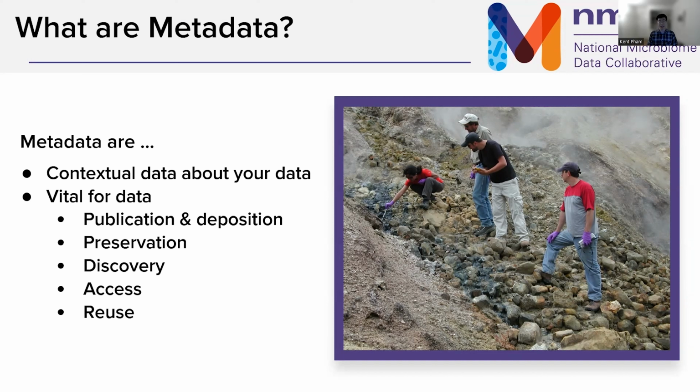It's everything else that you are writing down or making note of, starting with the local environment when you go out there, what techniques you might be using as you collect your sample, and also everything that happens back at the lab. It's important that you capture this metadata not only for publication's sake, but also to ensure that your data is well supported and abides by FAIR data standards.